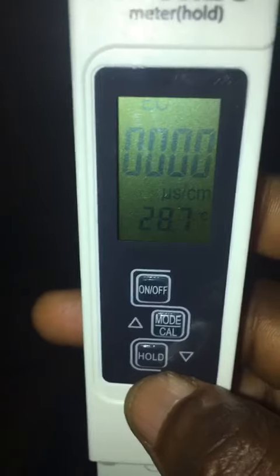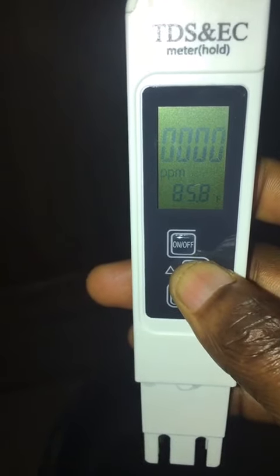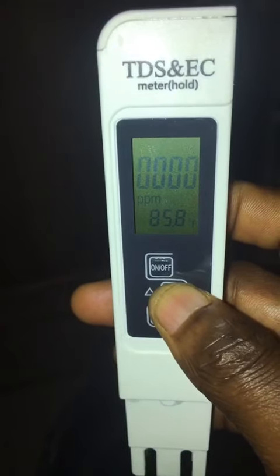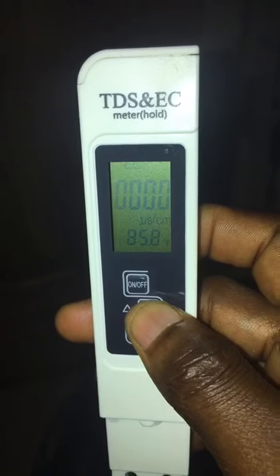This is the TDS31 meter. To check for switch mode, you press the mode button. Tap it to change from EC — now it's in PPM. If you want to change it to EC, press mode again. You can see it has moved to EC, with temperature in Fahrenheit.